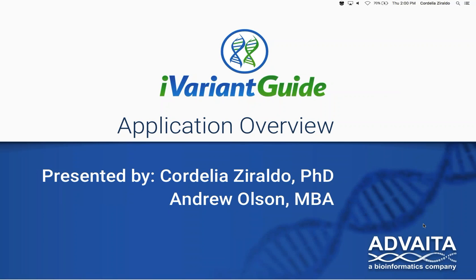Hello and welcome to today's webinar. We will be covering Advaita's new application, iVariantGuide. My name is Andrew Olson. I'm the Vice President for Business Development here at Advaita. And today we have one of hopefully many upcoming webinars on our new variant application.